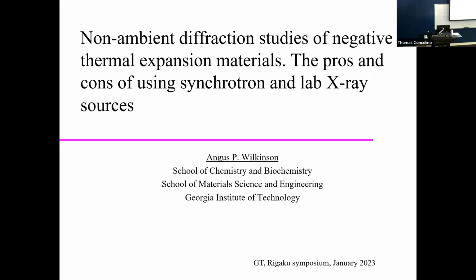Now, the program says I'm going to be talking about in-situ studies, which is an enormous topic. I'm narrowing things down a little bit. I will be talking about non-ambient diffraction studies of negative and low thermal expansion materials today. Nearly all of this work is actually done using synchrotron X-rays and neutrons, but I'm going to try and put my work in the context of what might have been possible if we had X-ray equipment that's just arrived a few years ago and this work was actually done.